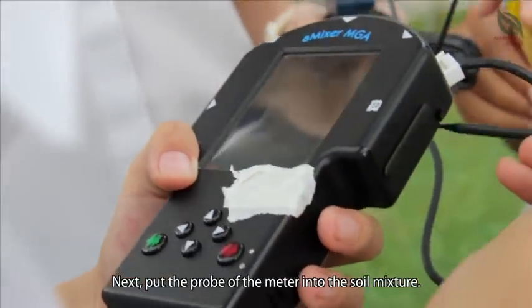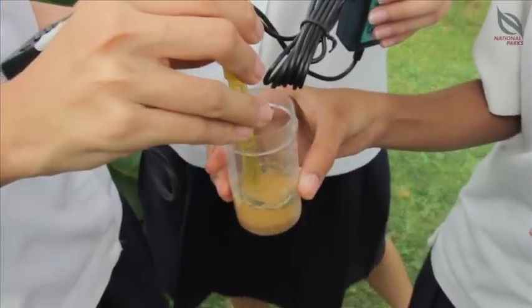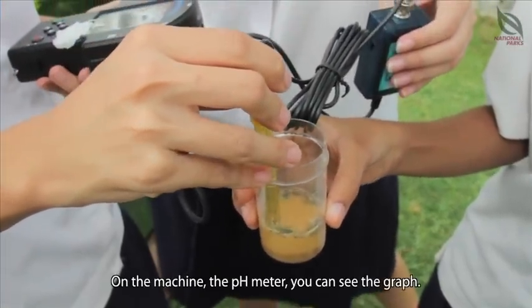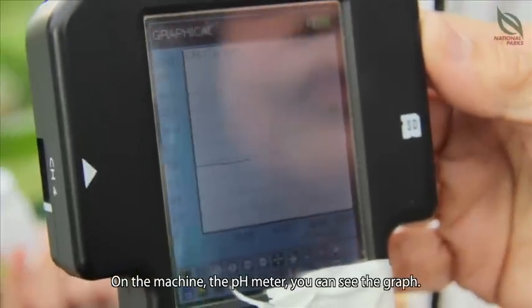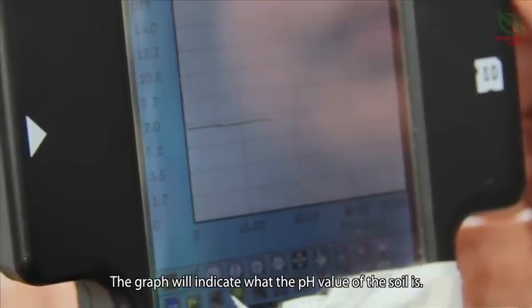Next, we can use the probe of the meter to put it into the soil mixture. On the machine — that means the pH meter — you can see the graph. The graph will indicate what the pH of the soil is.